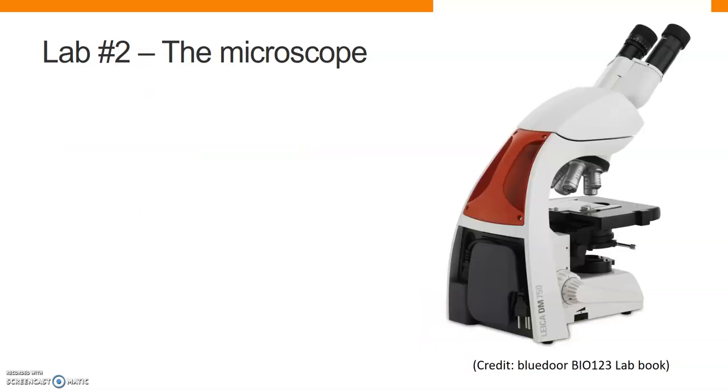Let's start by just looking at the microscope. This is the microscopes that we have in our labs, both in our general biology class and your microbiology class. In our lab, we only have three objectives. So that will change this number right here. We're going to go through all the parts. These are what we call objectives. There's only three of them in our lab. In micro, you'll have four of them.